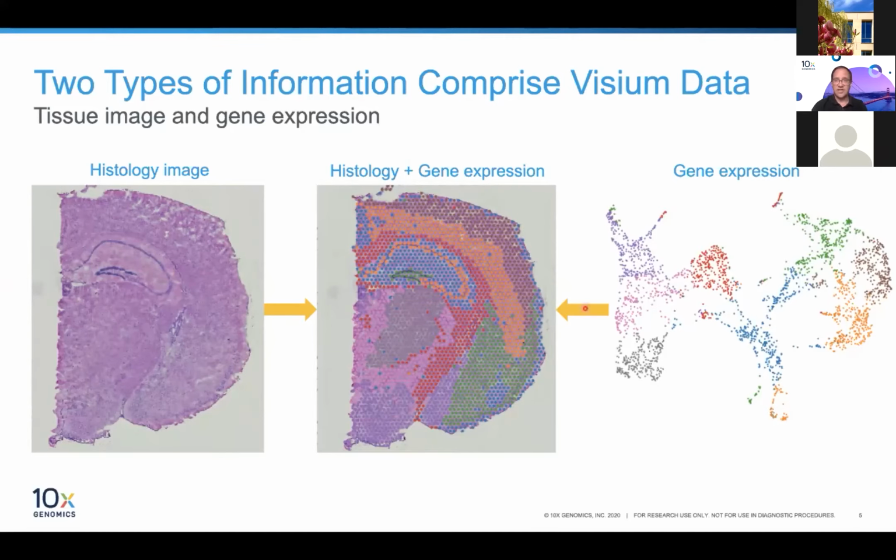So we've got the H&E image and the gene expression data overlaid. In terms of the gene expression, if we look across standard tissues, we can see north of 5,000 genes when we do this kind of analysis. So even though it appears we're only looking at the expression of individual genes, these different areas can actually be composed of the expression of hundreds or even thousands of genes.